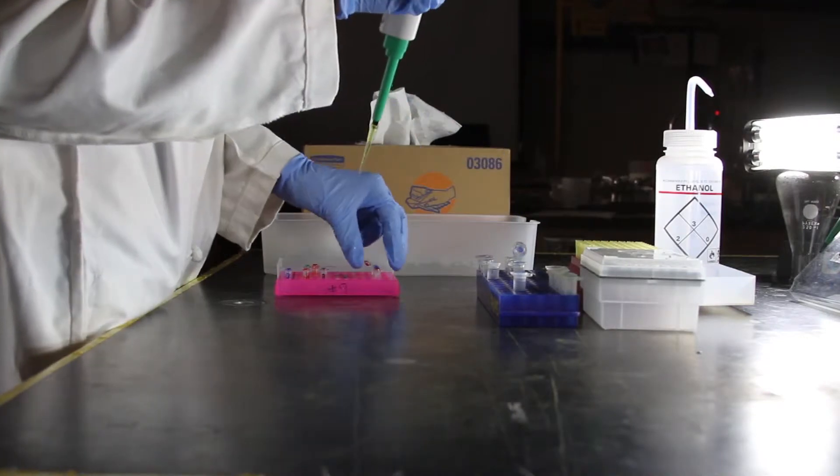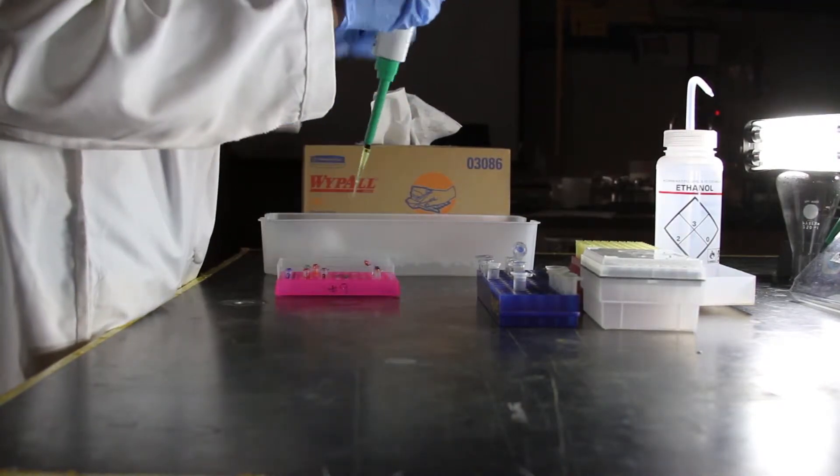Add distilled water to the tubes for a total volume of 42.5 microliters in each tube.